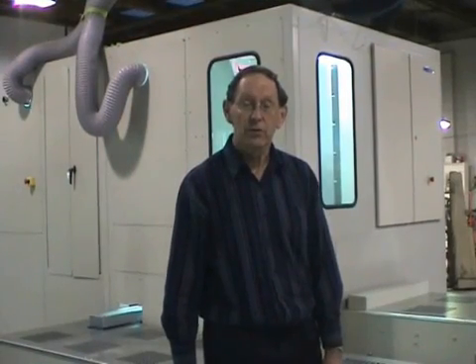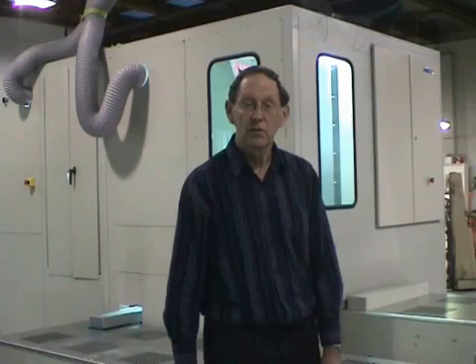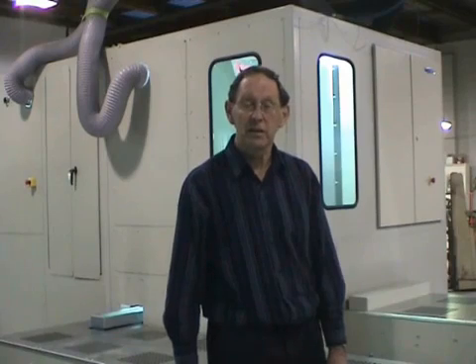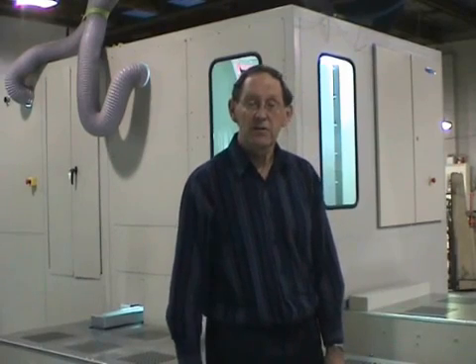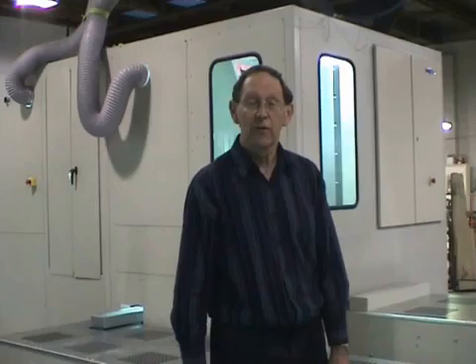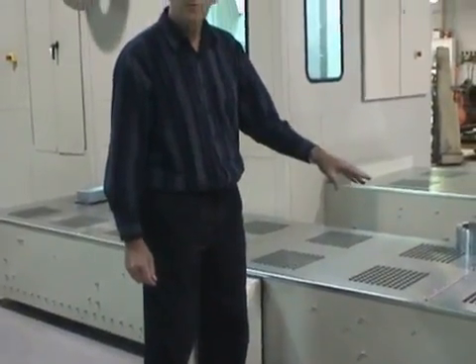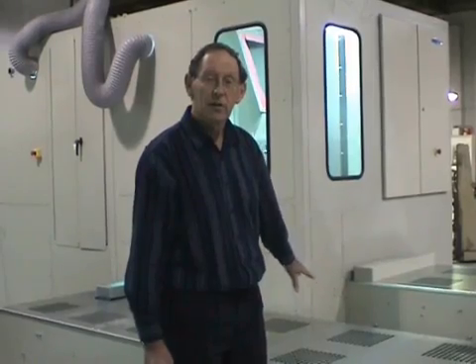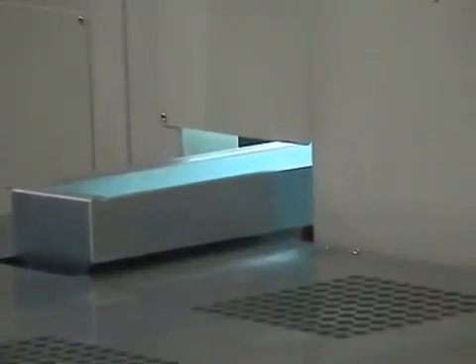With a commercial laboratory, clients often want to retain the whole sample for possible future use, for a metallurgical experiment, or possibly to be reanalyzed again at a later date. There must be provision for collection of all the material that does not go to the pulveriser and into the final three splits. In this conveyor we have ten bins similar to the other one, and the bins will have a sample bag inside and they will come along the conveyor to collect the sample from the feeder at the end of the conveyor.